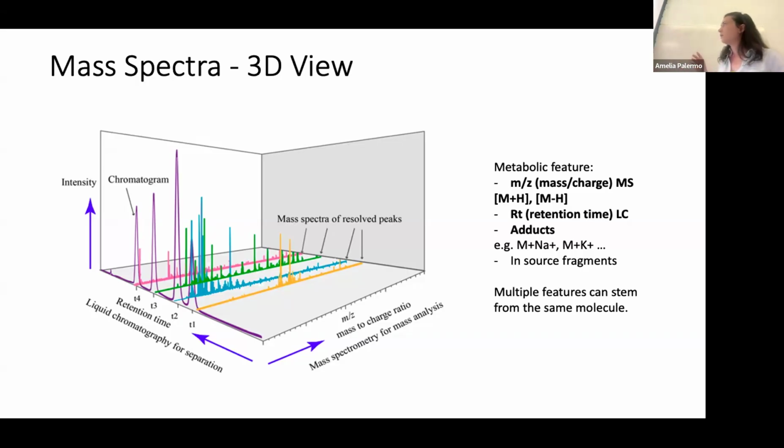Okay, so our molecules are in a sample, and this sample is injected in a mobile phase through the chromatography. Both the sample and the mobile phase contain sodium, potassium, sometimes ammonium, sometimes other components like formic acid. These are atoms or components that can easily complex our analytes.